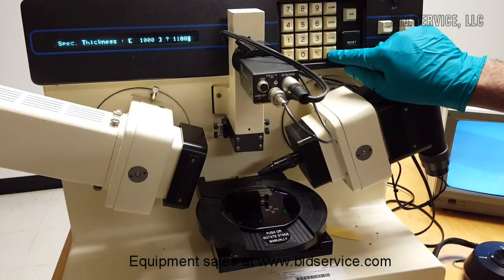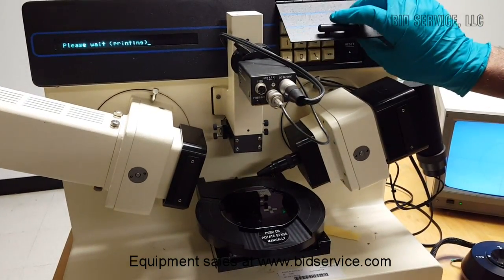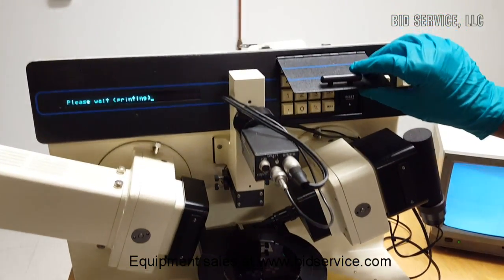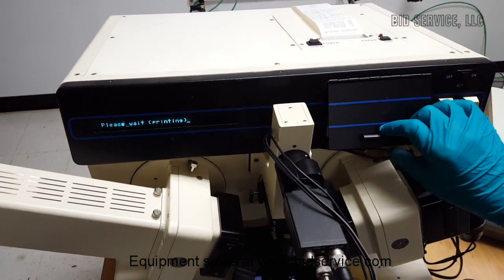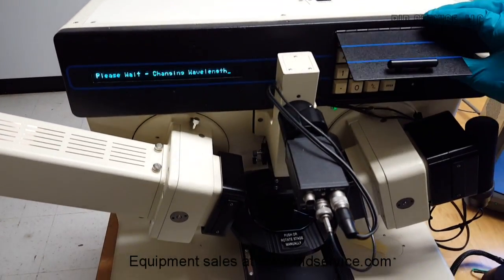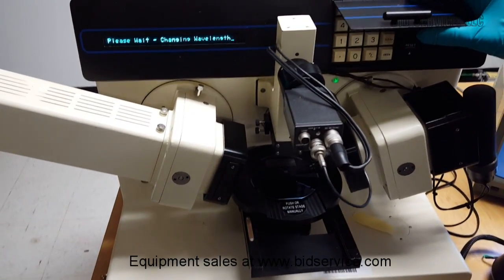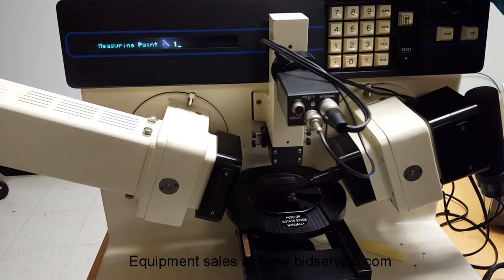So we enter it. There's a thermal printer on the system which prints as the system is in operation, and also it will print various program parameters such as pattern file number, program file number, measurement routine number, and calculation routine number.